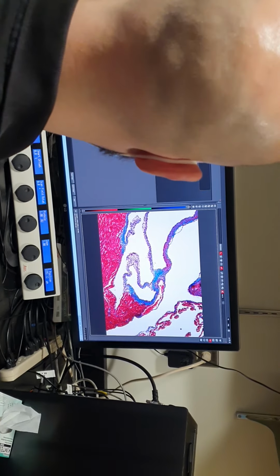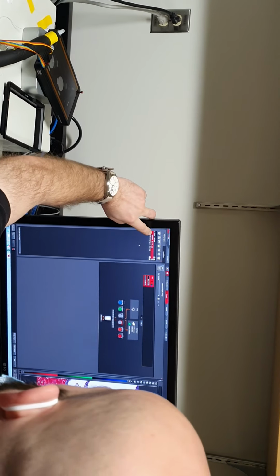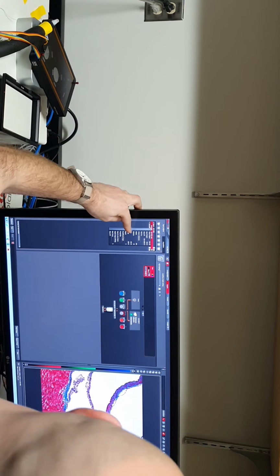And it will have captured our image. And now if we go under Open Projects, we've got our file. And again, it just gives it a generic name, and you can right-click or F2 and rename it whatever you want.